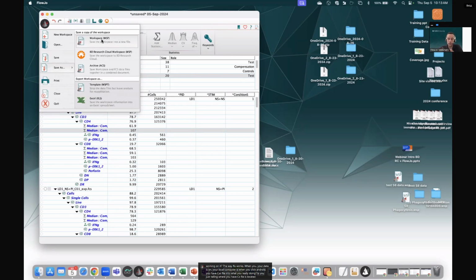So like that, when you do all your stats or when you're asking for the graph, FlowJo is going to pull that FCS file to display or calculate the value that you're requesting, which makes it really functional if you have a lot of data, because it doesn't really require a lot of computer power to be able to display a huge amount of data. So really a great way to save your data when you're still working on it.